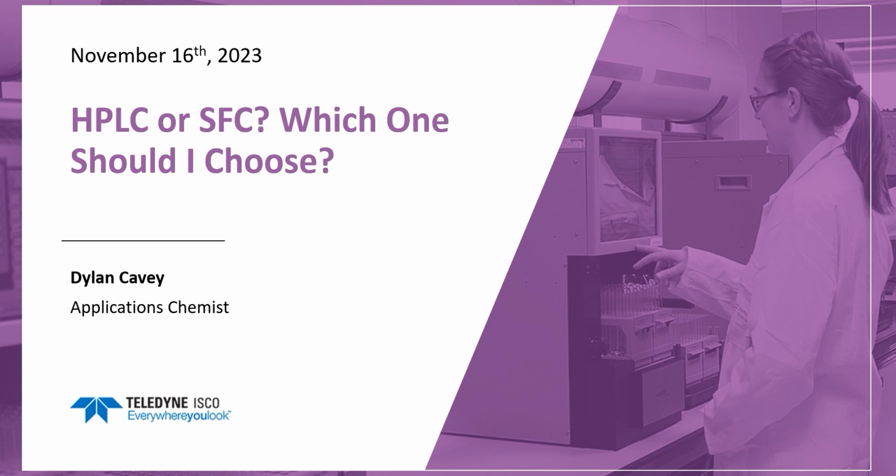Are you looking at chiral compounds? Well, then you might look at using SFC. If you're looking at aqueous samples, you might choose HPLC. So we're going to dive into the pros and cons of each of these chromatography techniques and when you might want to use one over the other.